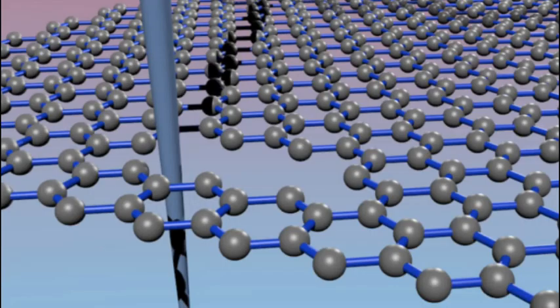And this is actually schematically how you do it. You see the gray cone there actually represents the electron beam.